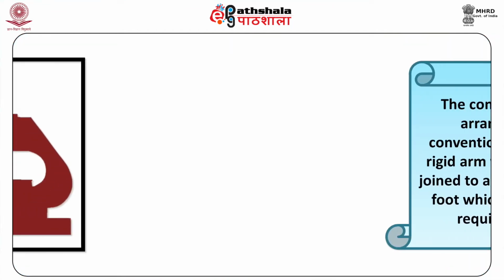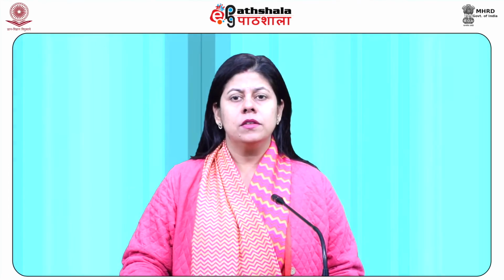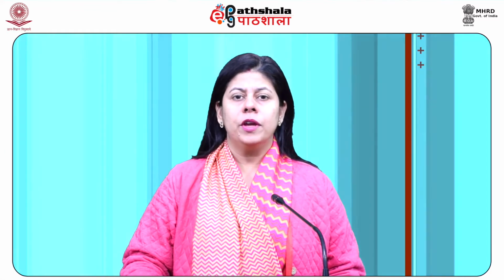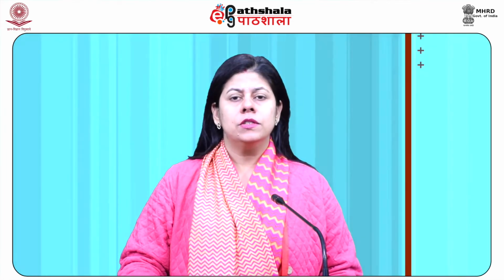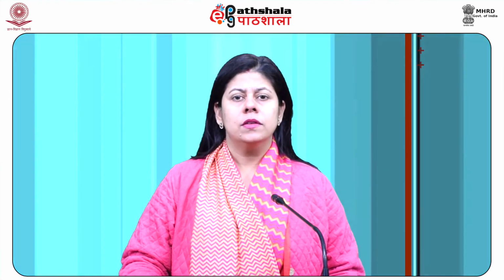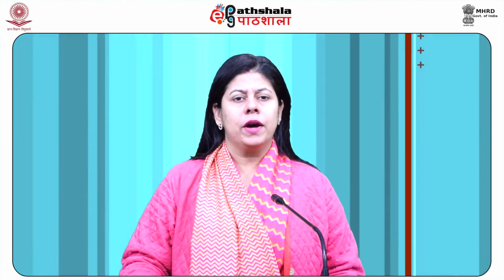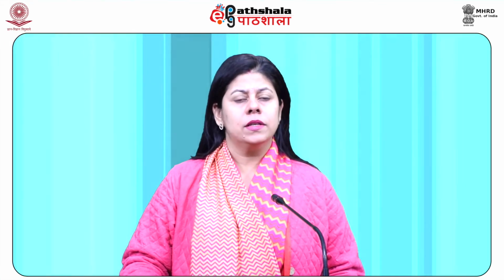Frame. The complete optical arrangement is conventionally fixed to a rigid arm, which is further joined to a strong U-shaped foot which provides the required rigidity. The viewing angle can be adjusted using an arm angle. The frame provides a mounting point for various microscope controls. Various controls for focusing, like a large knurled wheel to adjust coarse focus and a small knurled wheel to regulate fine focus, are present in the frame. The controls for the lamp and condenser are some other features mounted on the frame.